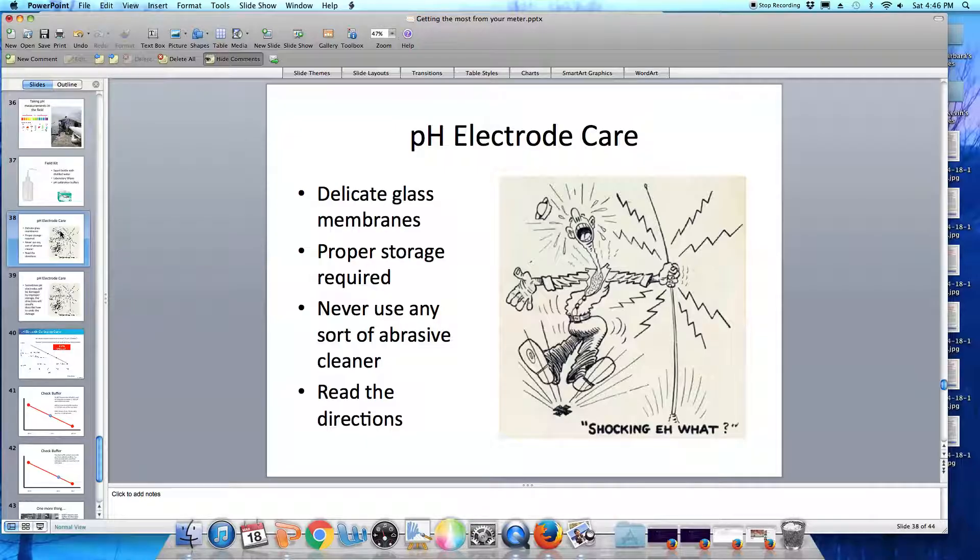You're going to learn how to do your electrode storage and how to clean your electrode, because, of course, like always, we're going to read the directions.